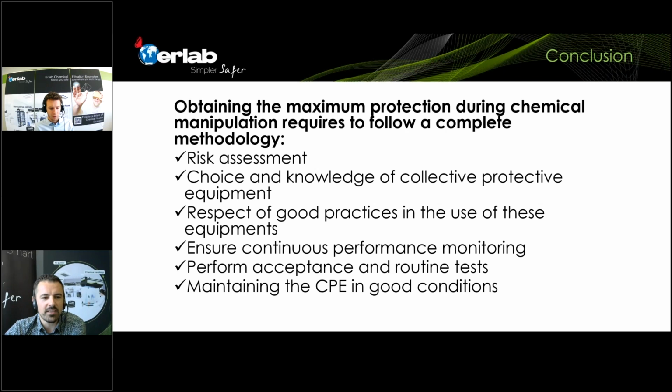Thank you. Another question from Joseph Chan. Can I manipulate mercury in trace amounts in the ductless fume hood? It's not allowed to be used in a ducted fume hood. Sorry, late question. Don't apologize, Joseph. We are still here, no problem.